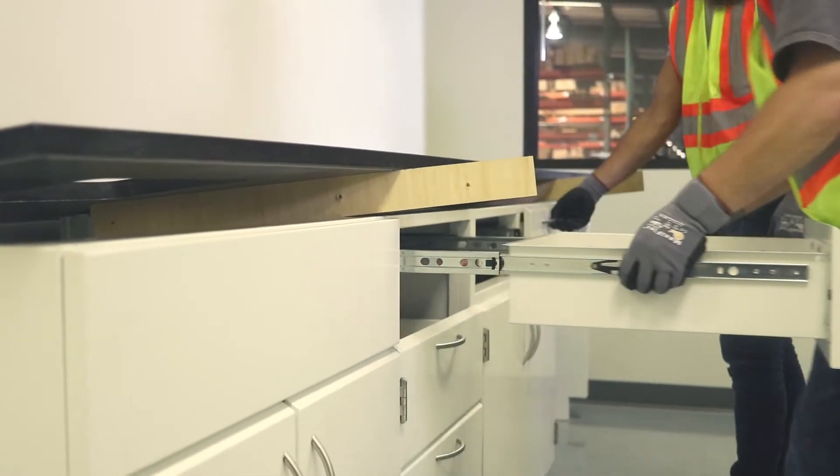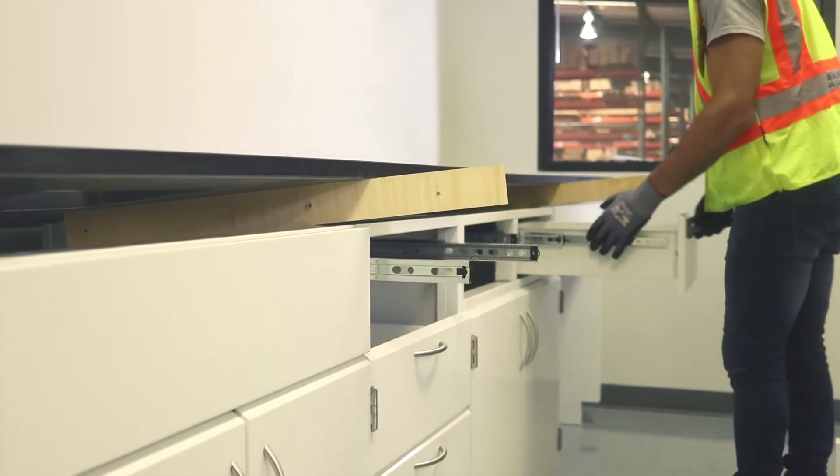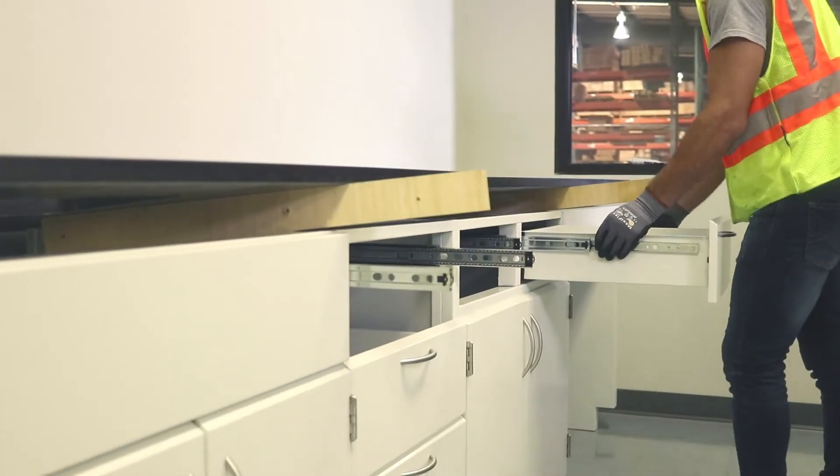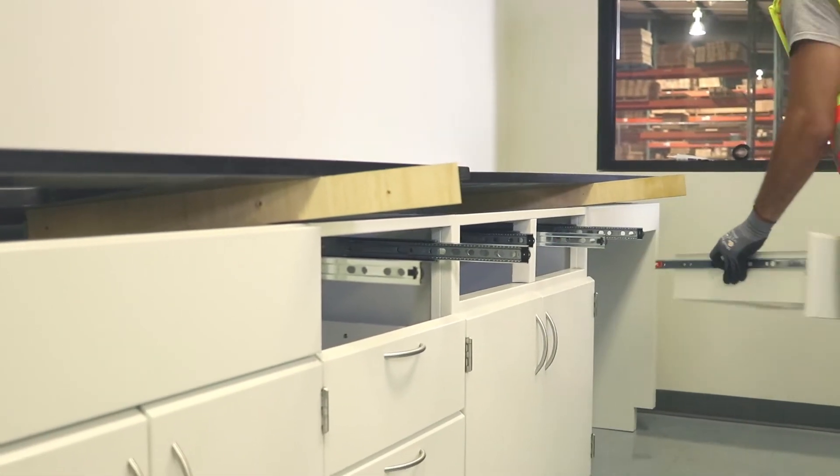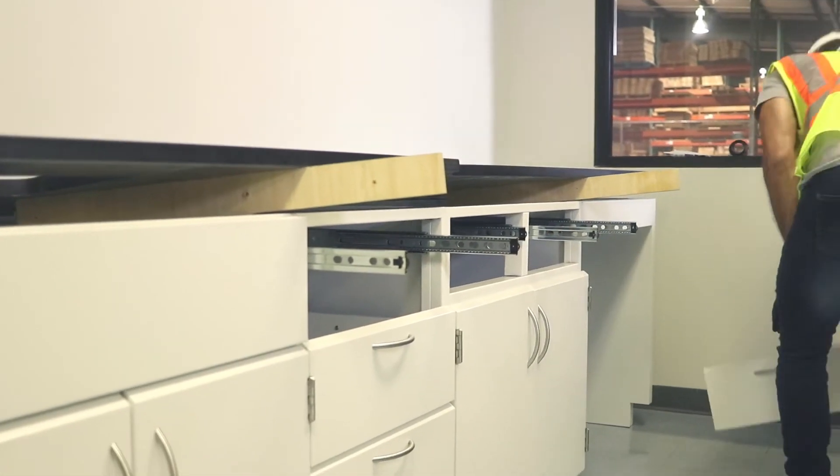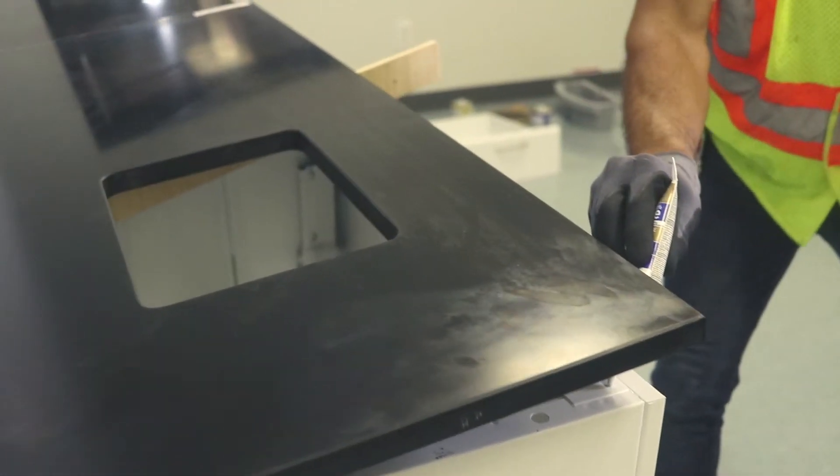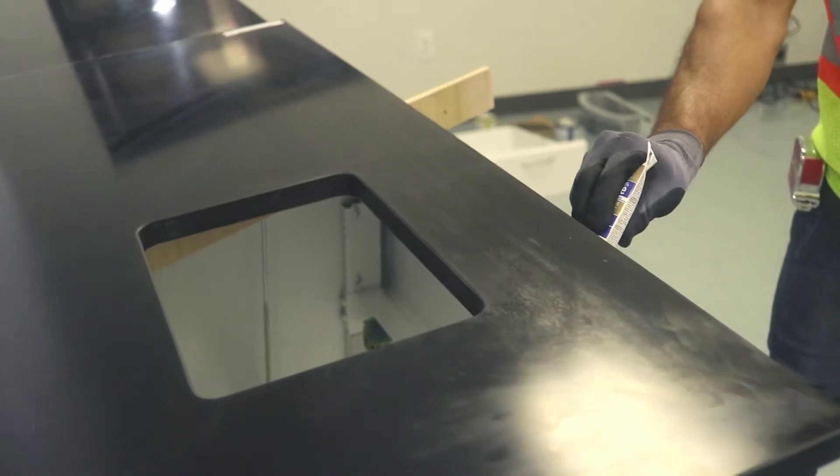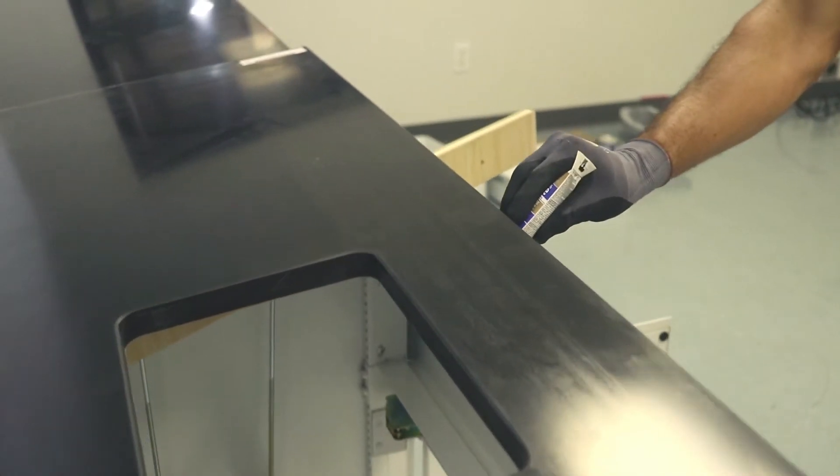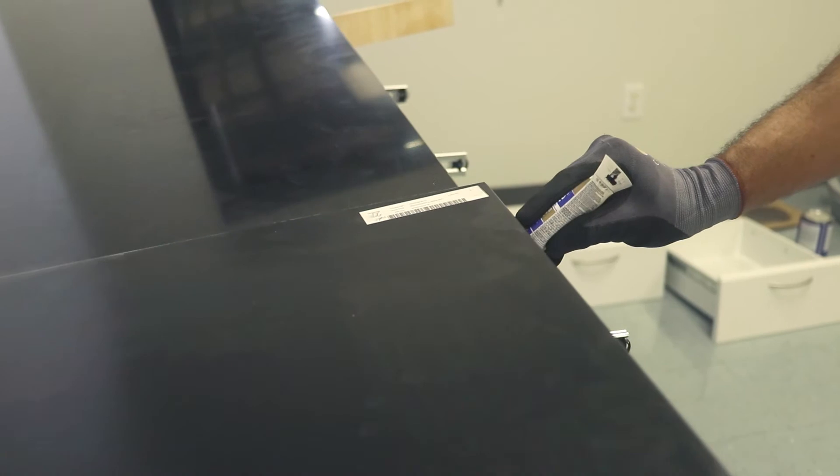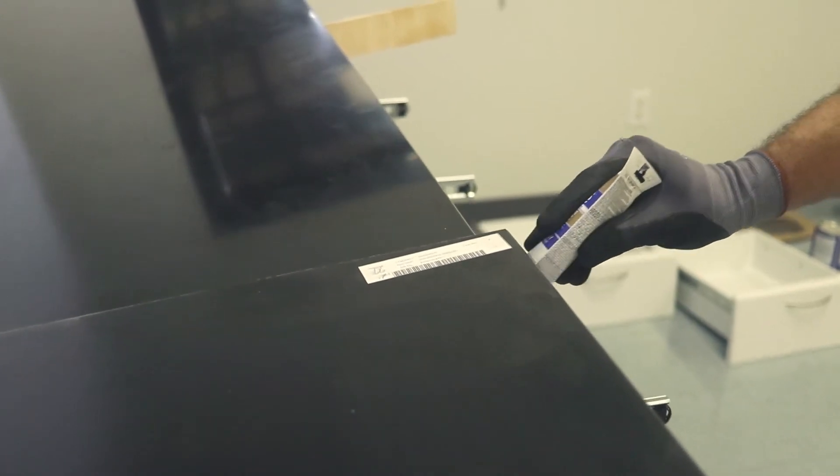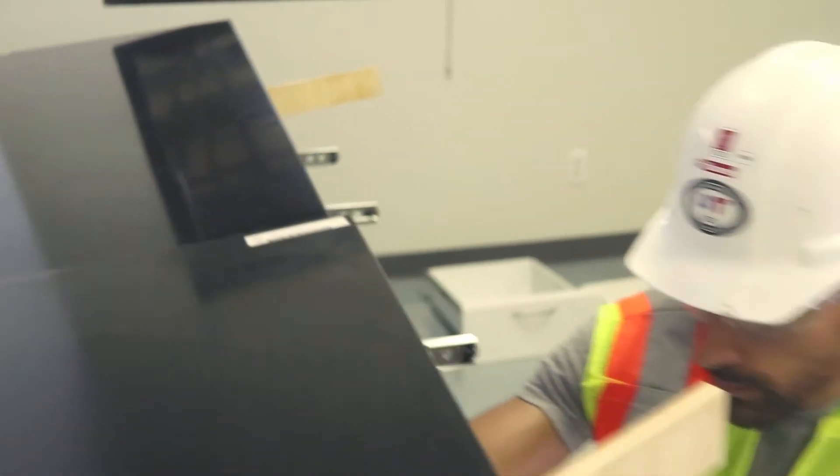Chem Resin surfaces should always be attached to base cabinets using silicone because it can be manipulated more easily. When a surface assembly is installed, the full elevation must be installed at the same time, not in sections.